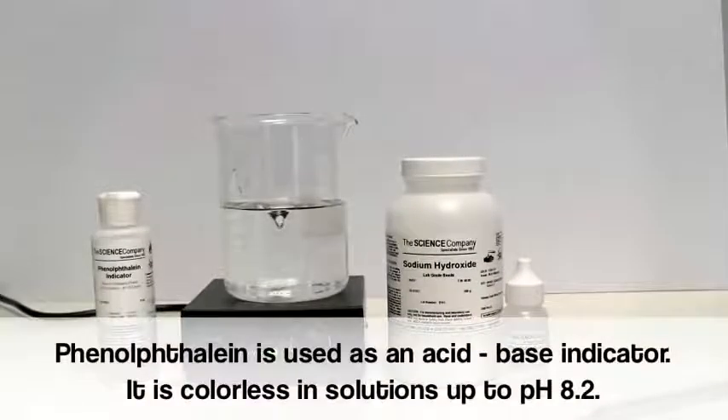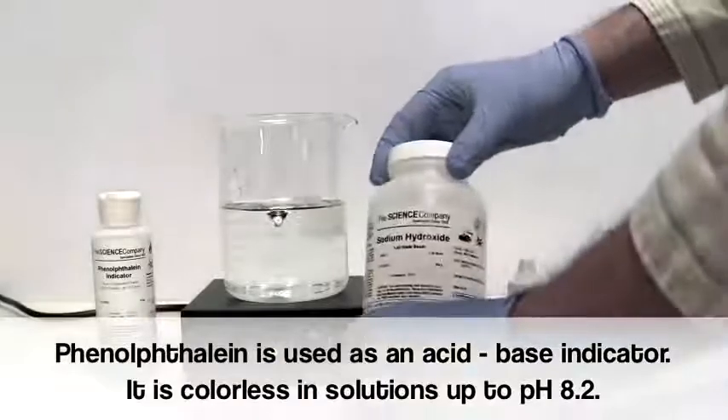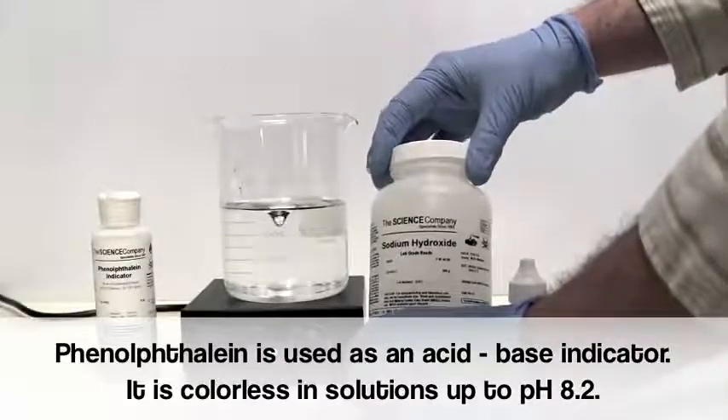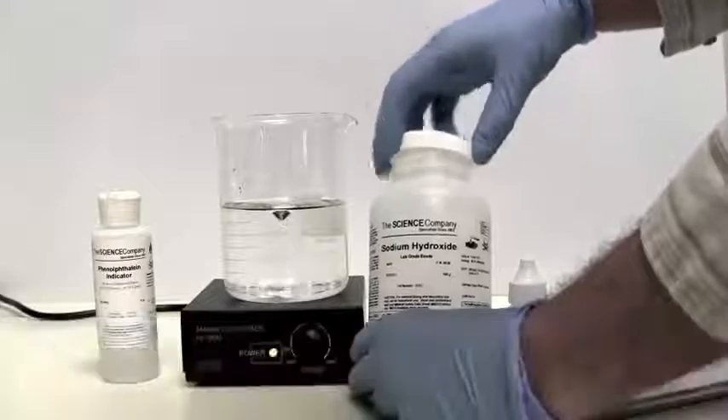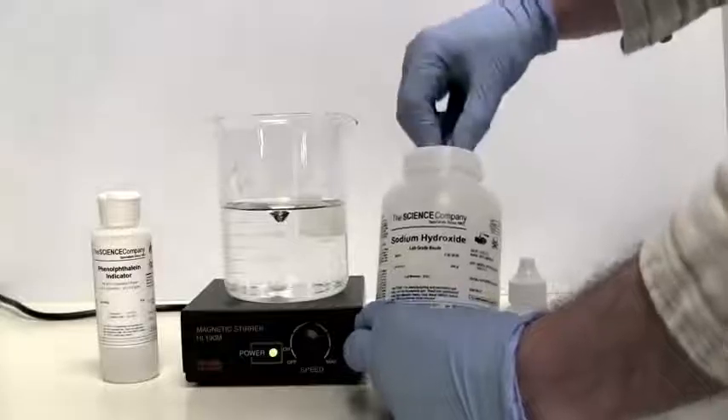Today we will present a simple demonstration of how phenolphthalein indicator changes color. Let's start with a beaker of plain tap water. We add a bit of sodium hydroxide to raise the pH into the alkaline range.